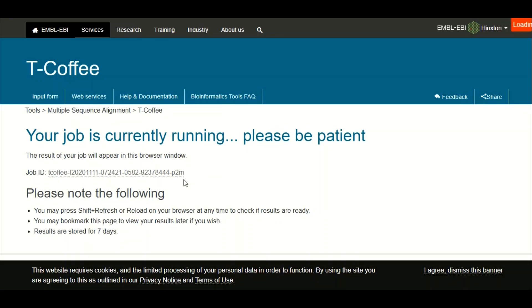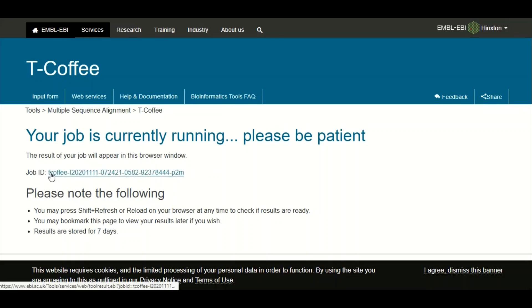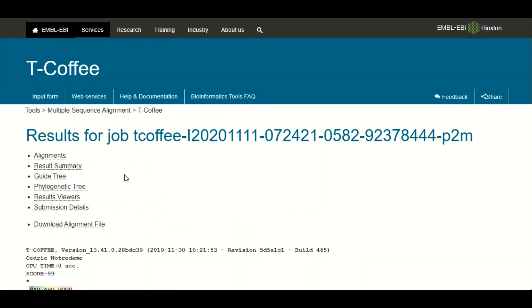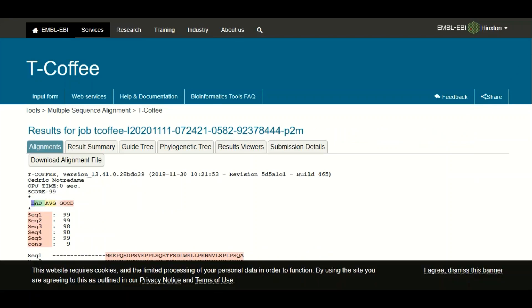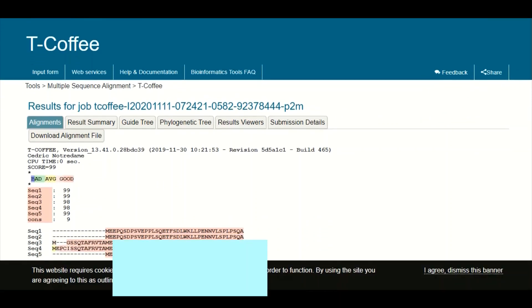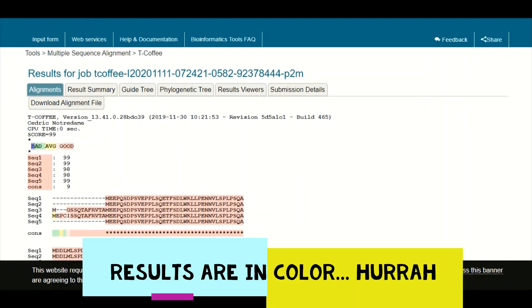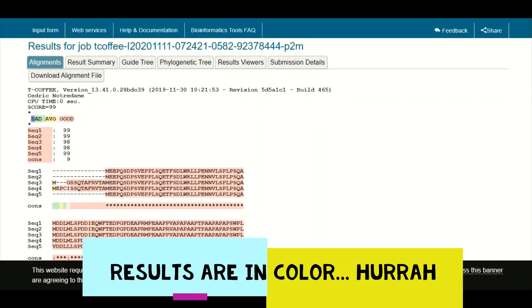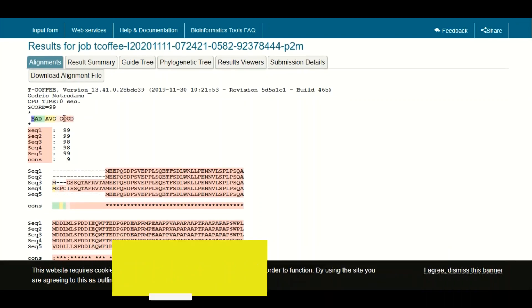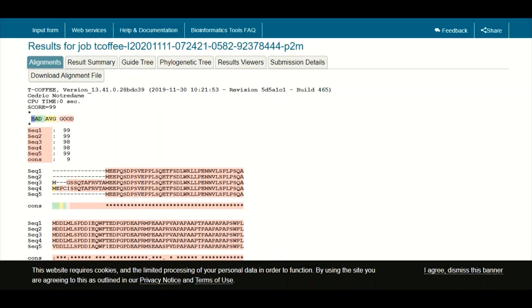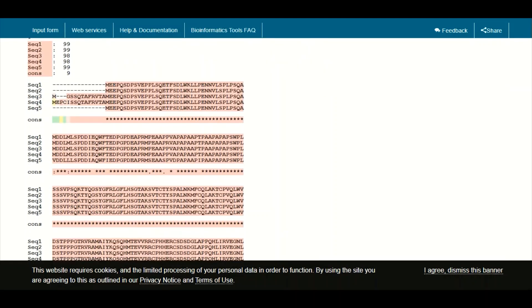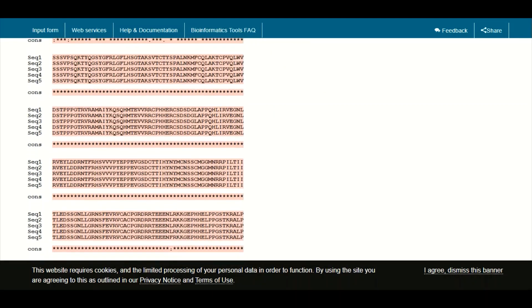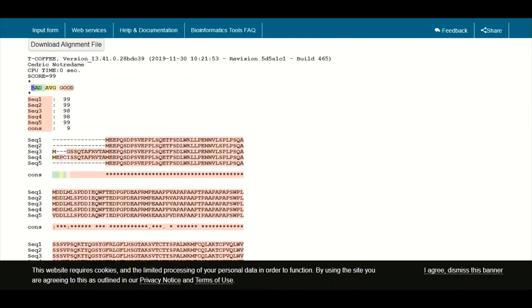This is a job link — you can copy and paste it for later use. If you click on it, you can visualize your multiple sequence alignment. Here you can see your multiple sequence alignment displayed in different colors.